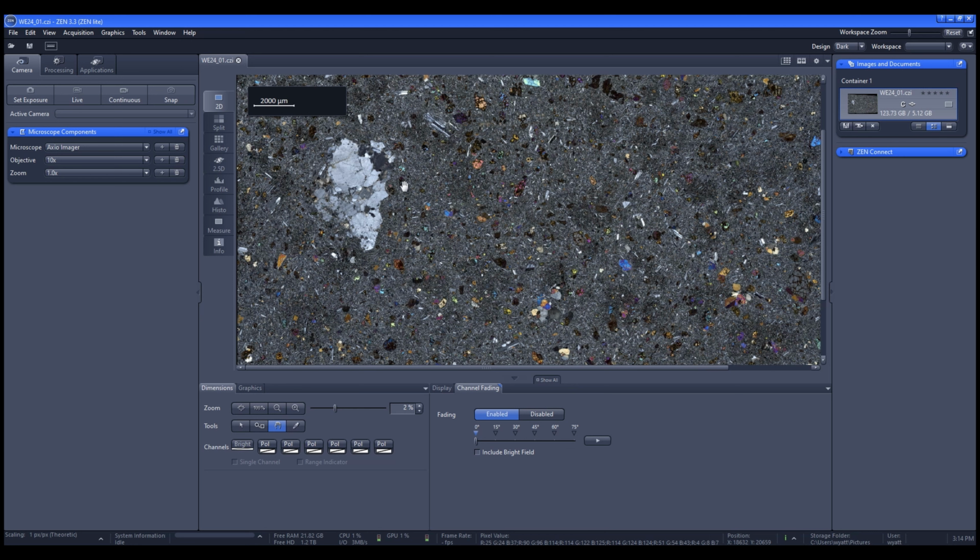There's some colors here. And one key thing to know about microscopes is there's two main views that we use. There's plain polarized light, PPL, and then there's crossed polarized light, XPL. This view that I'm in right now is XPL. That's essentially blocking off, I believe, about half of the light.